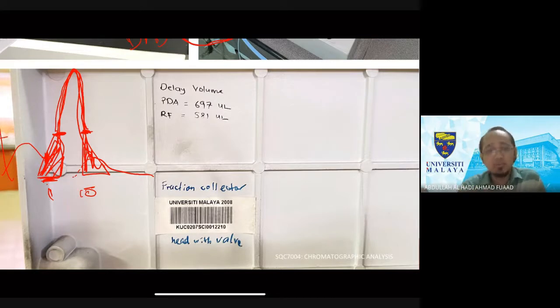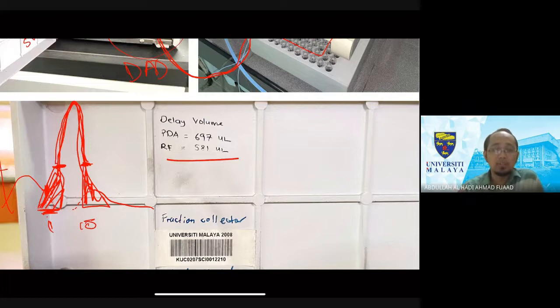Unless, of course, you have a lot of sample, then you might not need to care. But if your sample is very precious, especially in this lab, because we are doing a lot of synthesis, sometimes you don't have enough compound for final purification. So knowing this volume will help us collect every single drop containing a product.